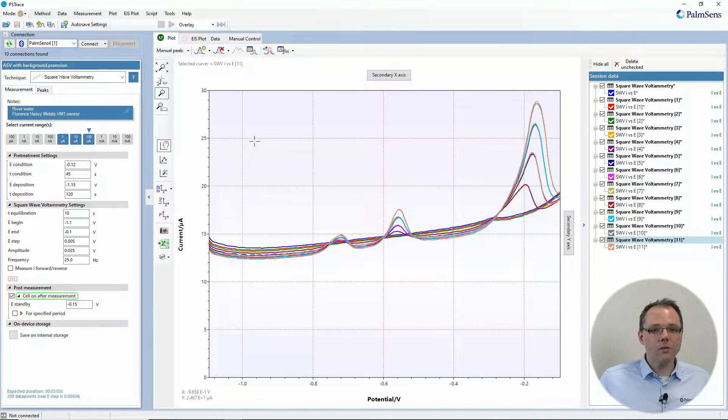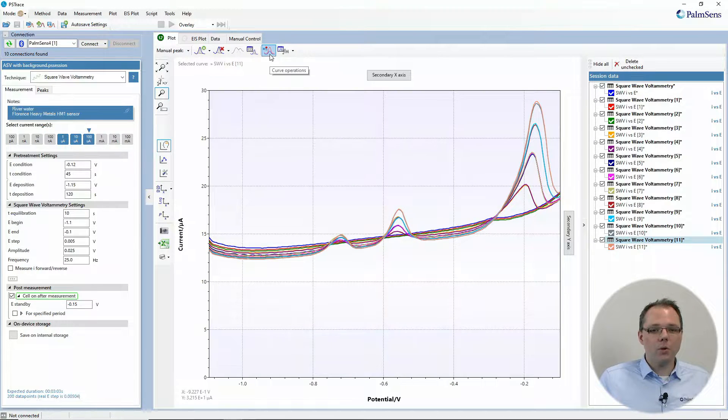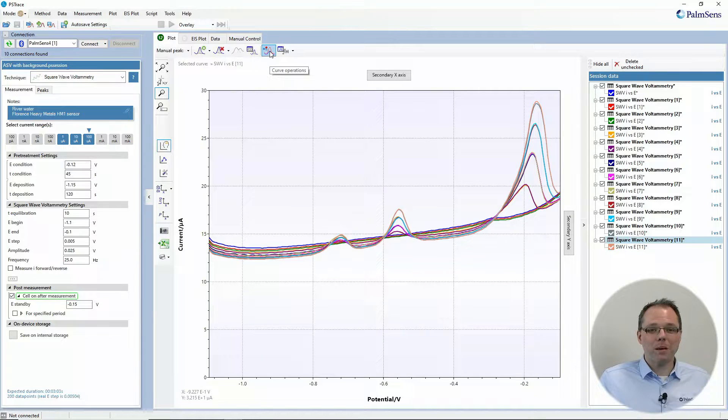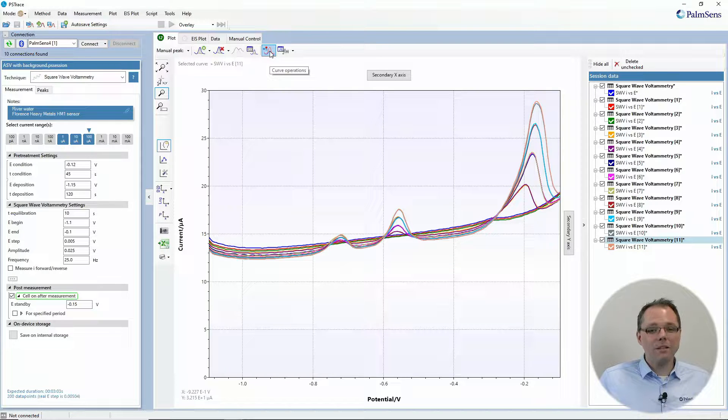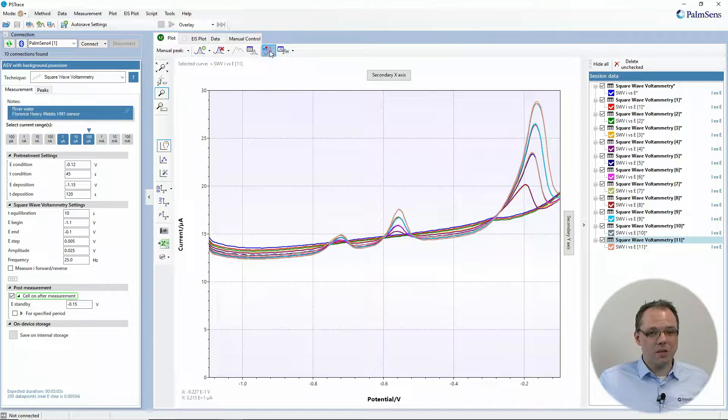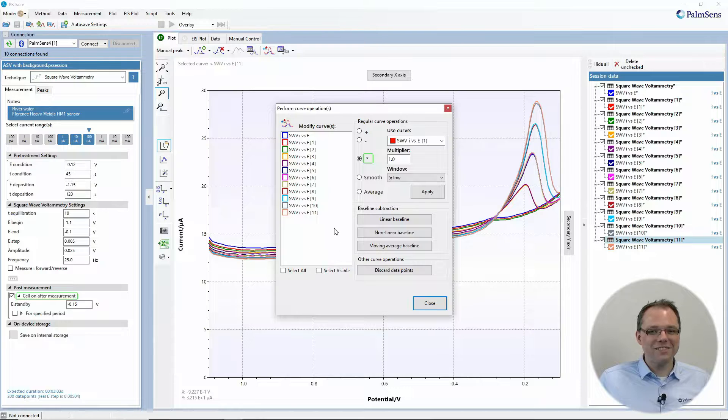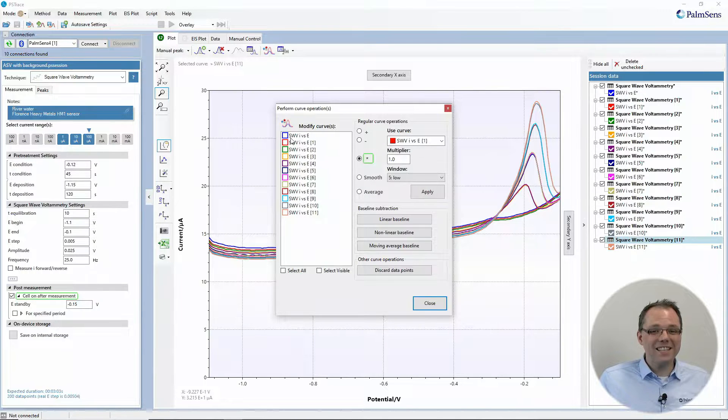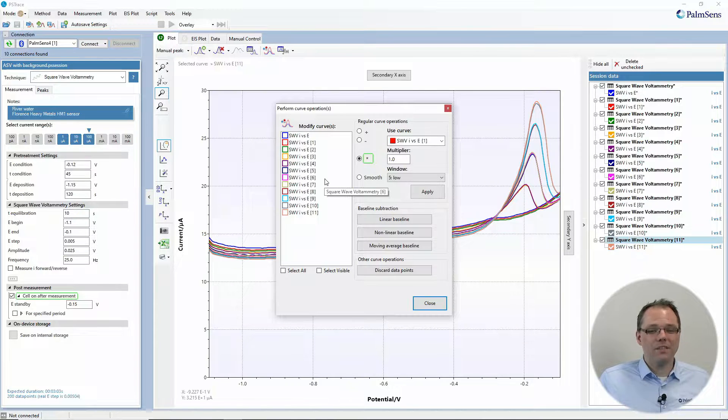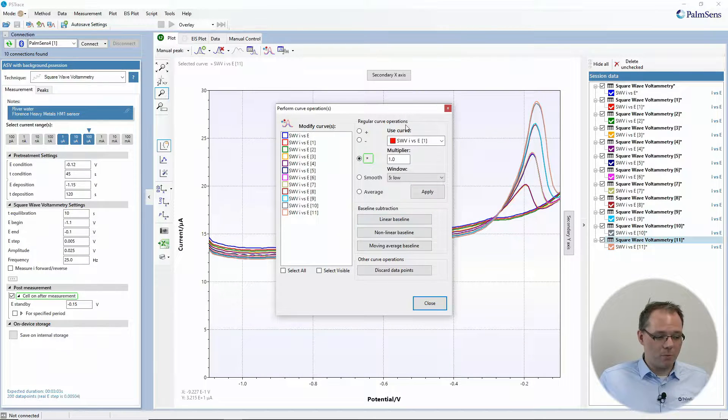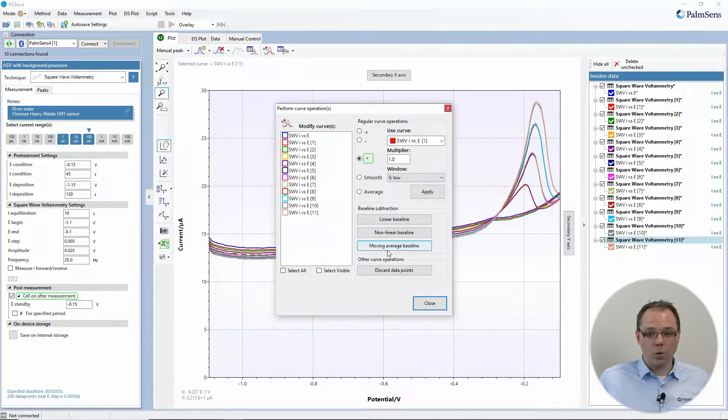Okay, so you find the curve operations here with that button that you might have seen a few times but might have been too afraid to click. So now I'm clicking it and you get a list of curves and a list of possible operations you can do.